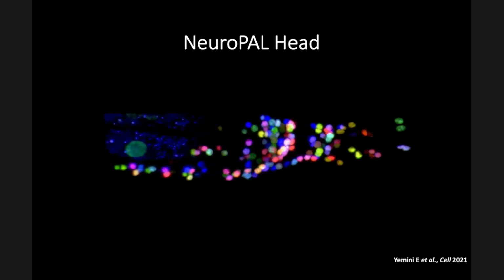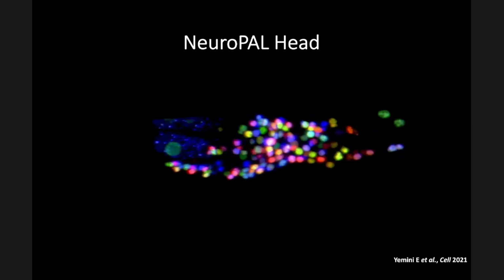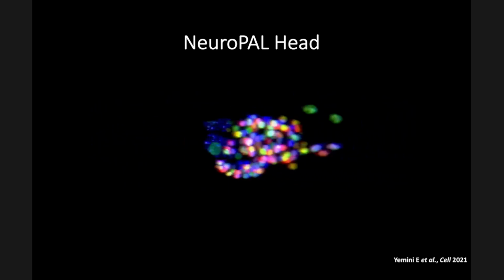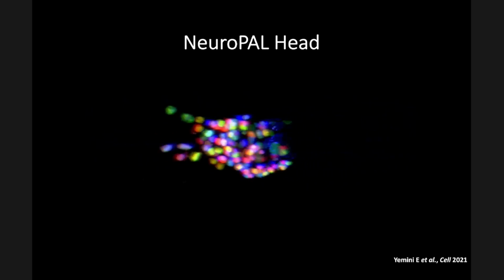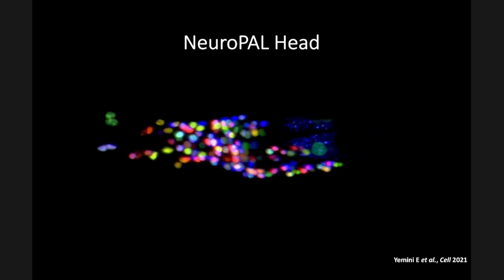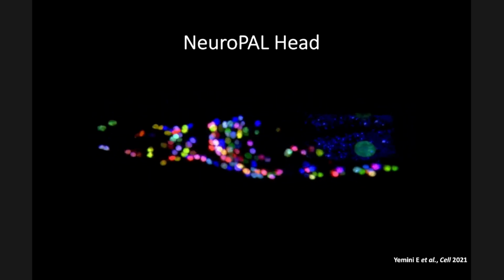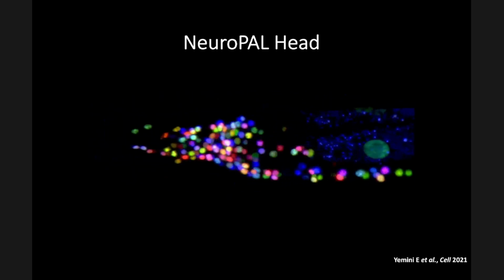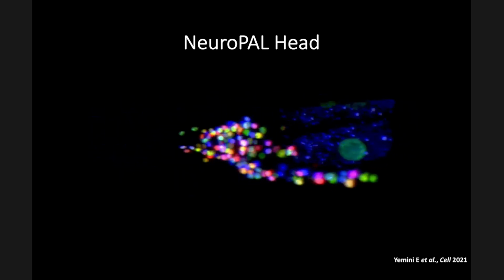And the way we solve that, so that instead of you getting a cottage cheese pattern or some weird looking pattern, in order to get the ball-like pattern, I attached it to histones, some of them, not all of them. And that has a very distinct look to it in different neurons. And even that, when you have enough resolution, can help. So that's I think a good illustration of it. That's a good point. There's a lot of different ways that you could get at it for sure.